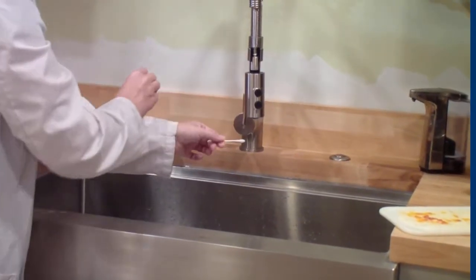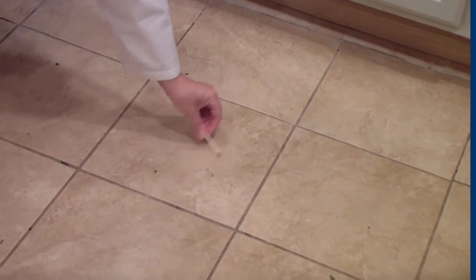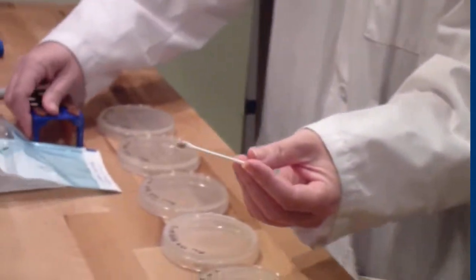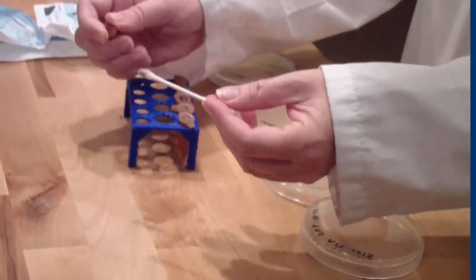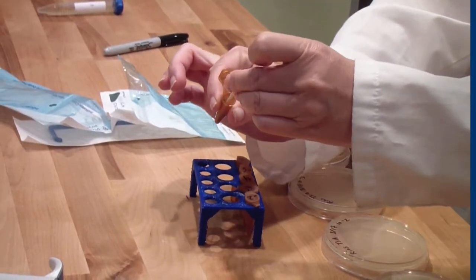Take your swab and moisten it with water and collect bacteria from a kitchen sponge, the floor, or a pet's water bowl. Once you've collected your sample, mix the sample into the TSB tube labeled ten to the negative one. Gently move the cotton swab up and down to mix the sample with the medium, and then discard the swab.